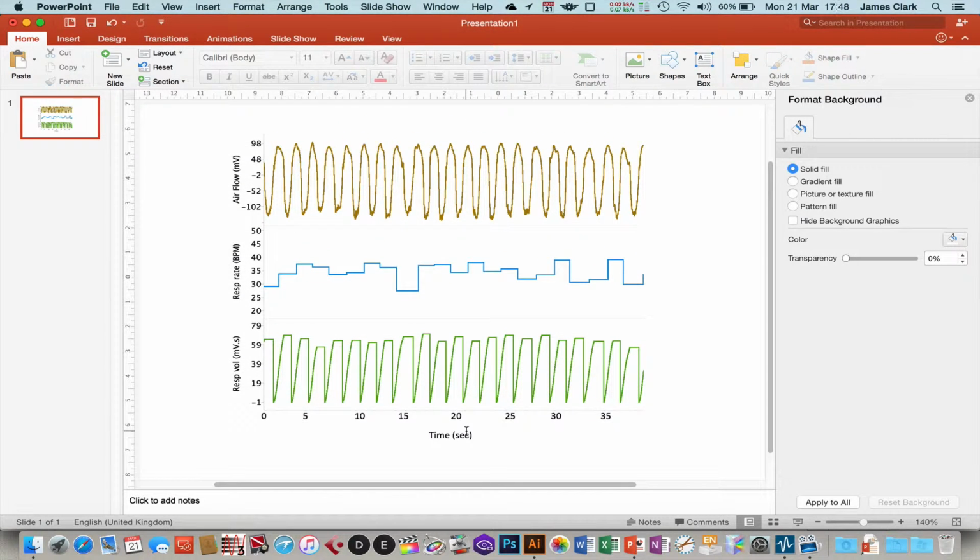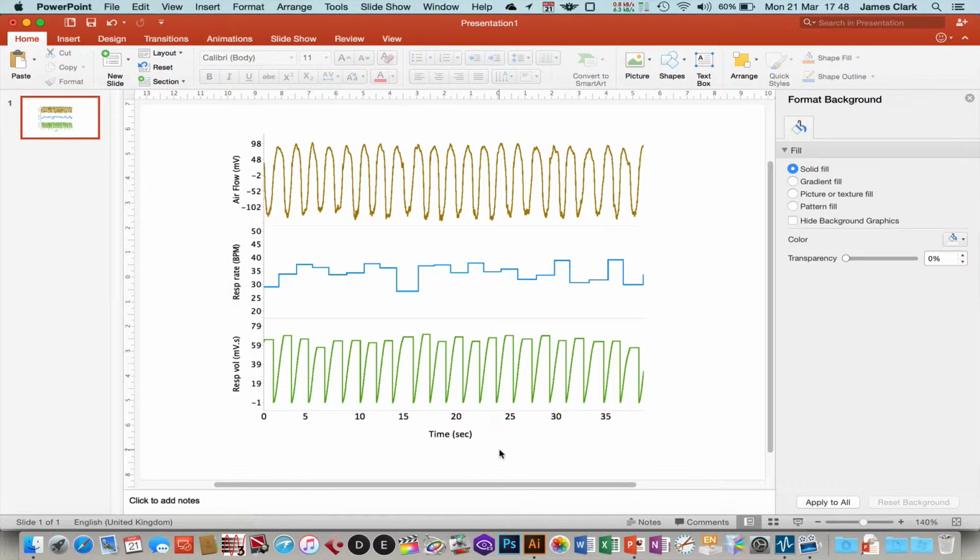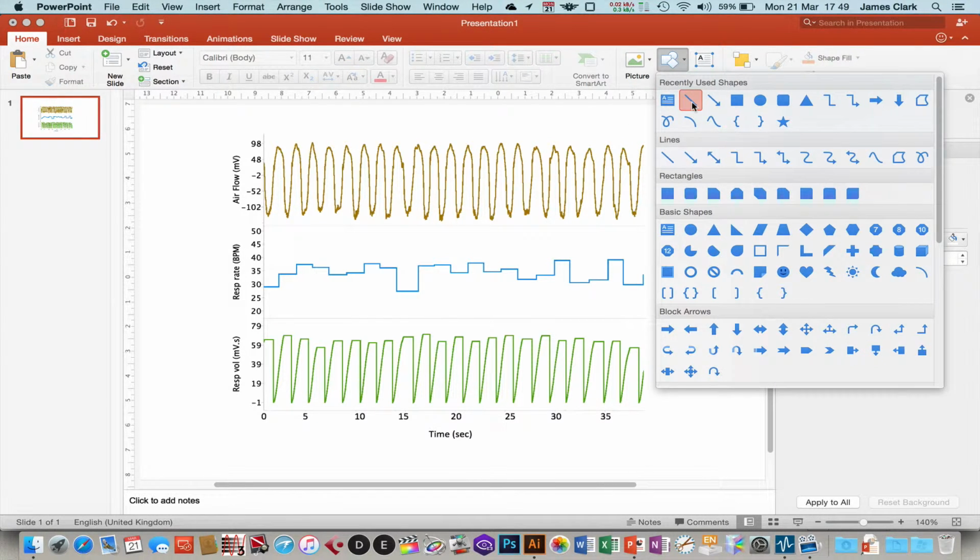Okay, so that took me about 3 minutes from start to finish, and I've now got what looks like a quite clean and tidy image. I may want to delete these scales accordingly and replace them with 100, 0 and 100. I could do that very simply just by, again, cropping in or covering it with a little white box and sorting that.